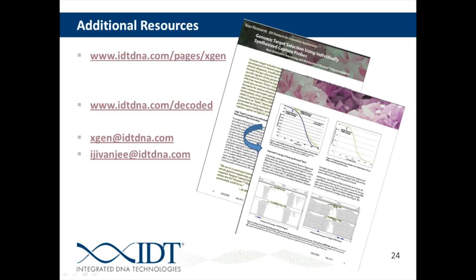At the moment, we feel the easiest way to extract exon sequences is using Ensembl. However, if you are okay with us extracting the sequences, we feel more comfortable with NCBI because of the version control that they have. However, we have some instructions if you want to go the Ensembl route and how to extract those sequences and send them over to us.